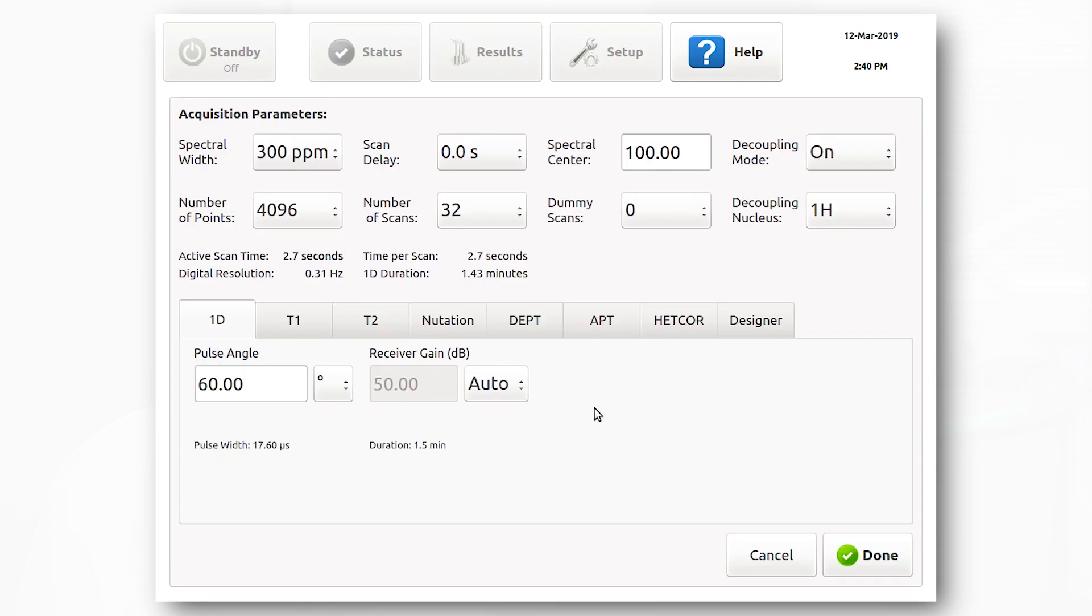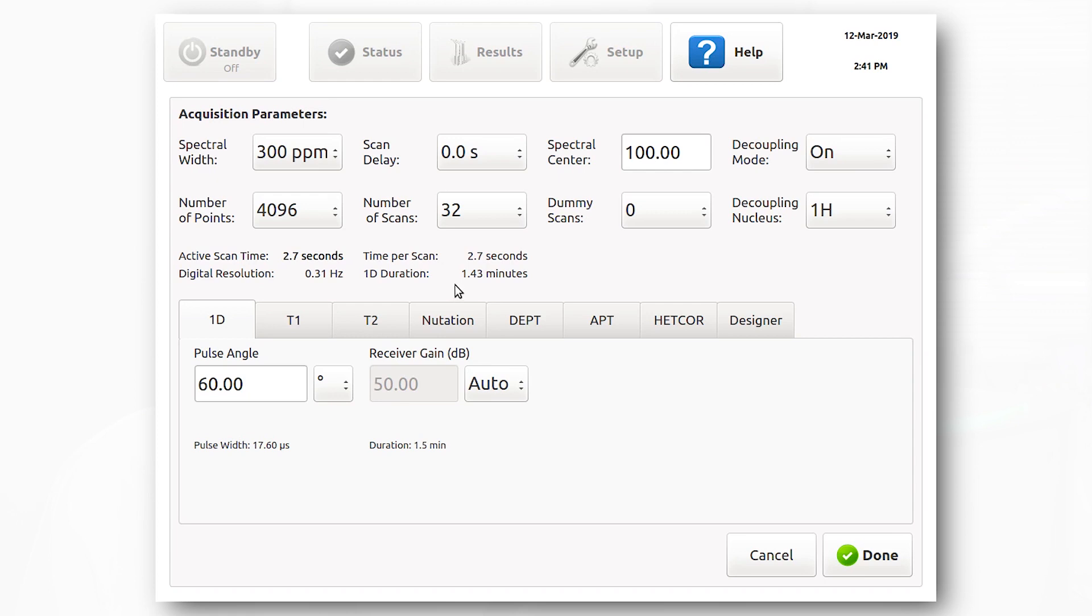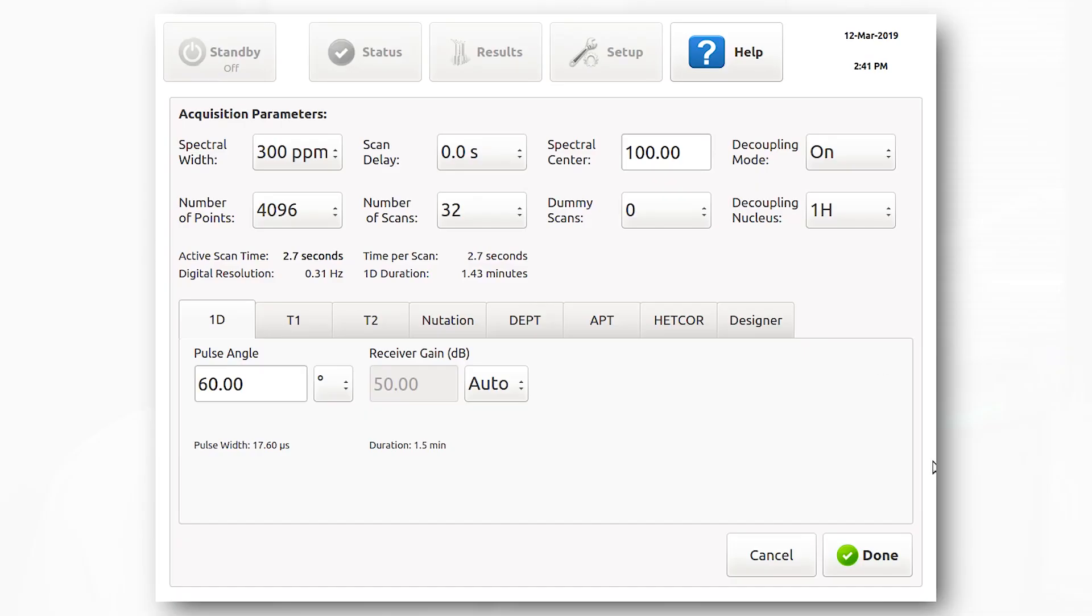Here you can change the spectral width, number of points to change the resolution, scan delay, number of scans, and number of dummy scans. After all this is set up, you can see the acquisition time by looking here.